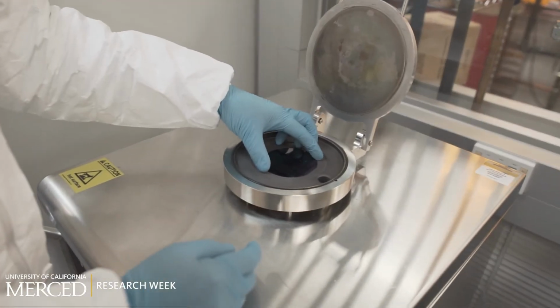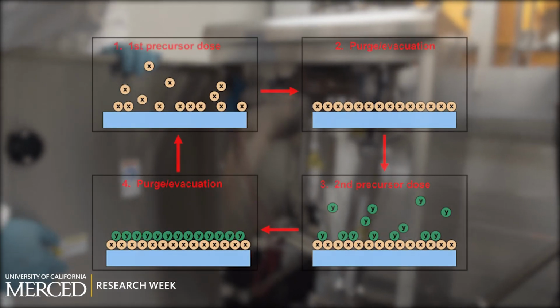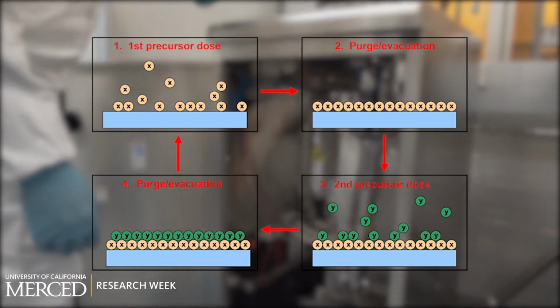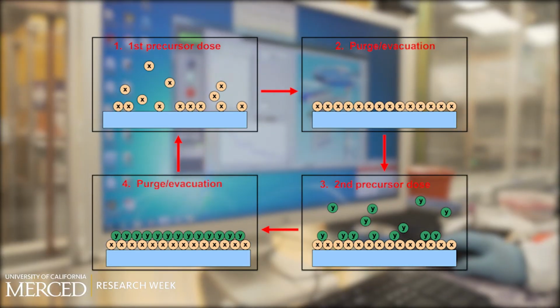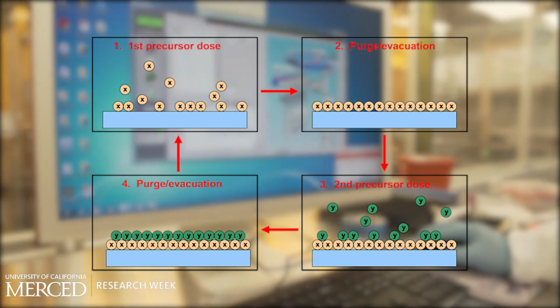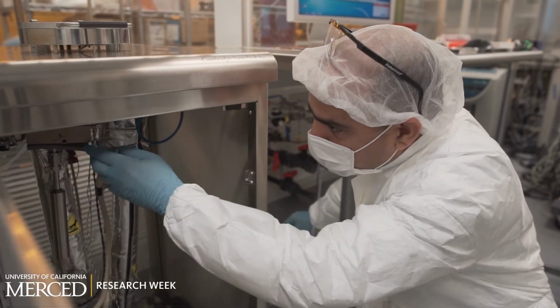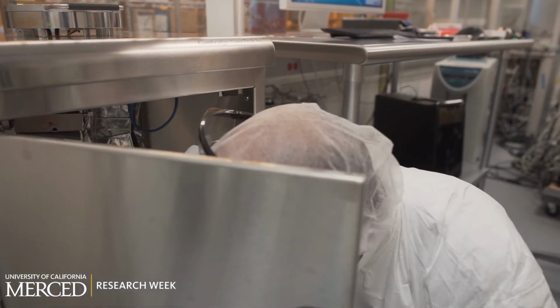Atomic layer deposition (ALD) is a vapor phase technique used to deposit thin films onto a substrate. The process of ALD involves the surface of a substrate being exposed to alternating chemical precursors which do not overlap but instead are introduced in a sequence until desired thickness is achieved. ALD offers exceptional conformality on high aspect ratio structures, thickness control at the angstrom level, and tunable film composition.